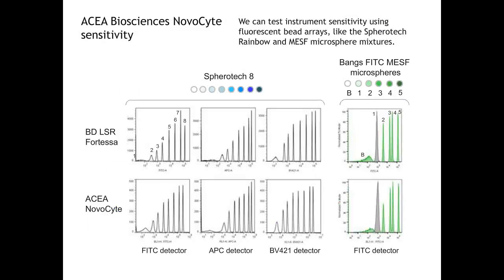These instruments are sensitive. We are able to verify this using calibration particles, Spherotech rainbow beads, MESF beads for FITC, for PE, for different fluorescent probes. And what we have found on all of these platforms is that the sensitivity is comparable to what we get off of larger traditional instrumentation.